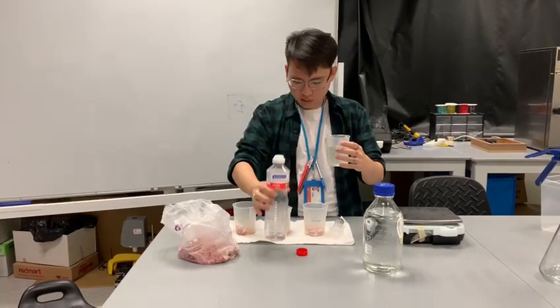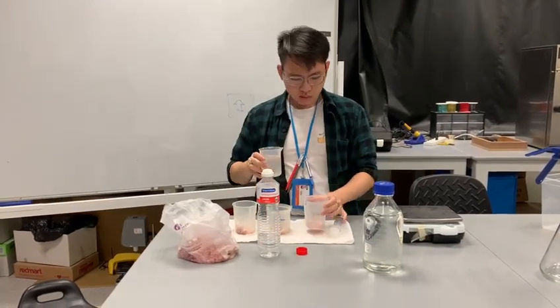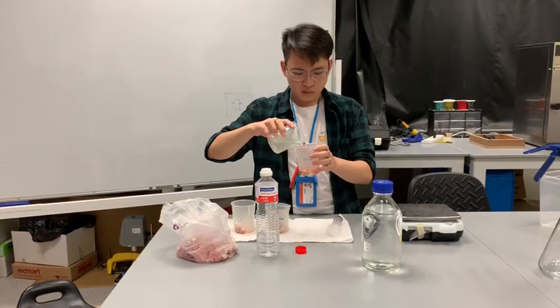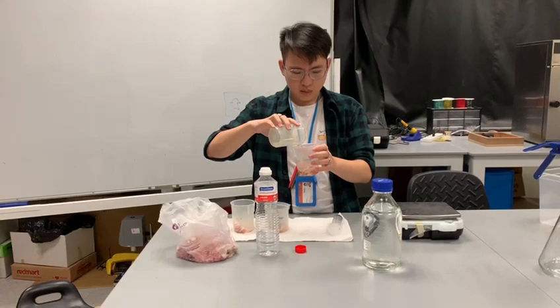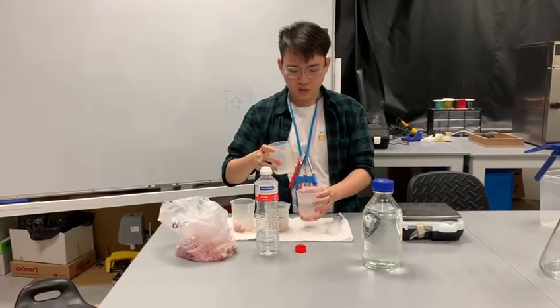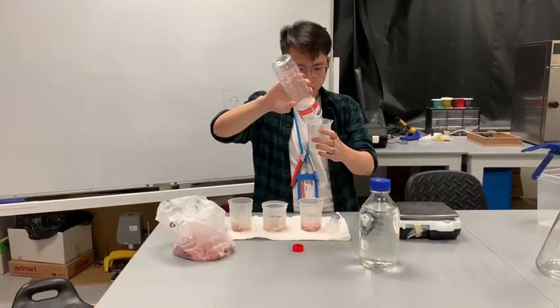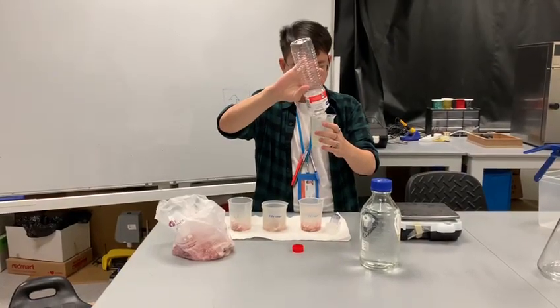Okay, 200 ml goes to our vinegar. That was too much, it's okay. And then we have 100 ml to our 1:1 solution.